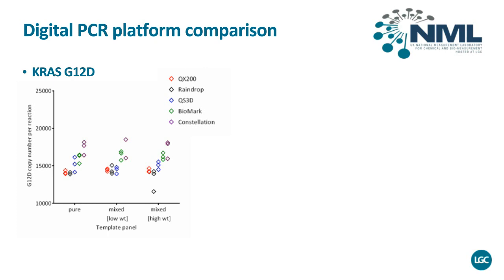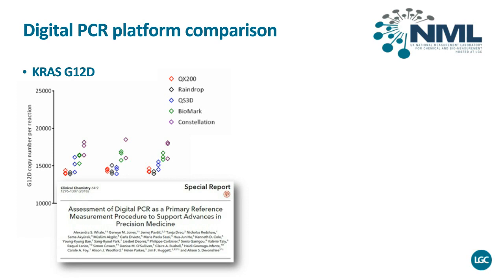And we can see that they're all very close in agreement. In fact, there's actually only 20% difference between the measurements. And while you may think that's quite a lot, these were actually all done without any calibration. We essentially put the material in the instrument, measured it, and then plotted the data here. So this was the ClinChem paper where this was published.